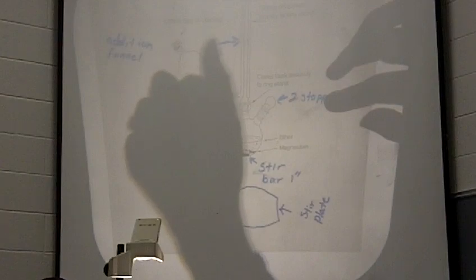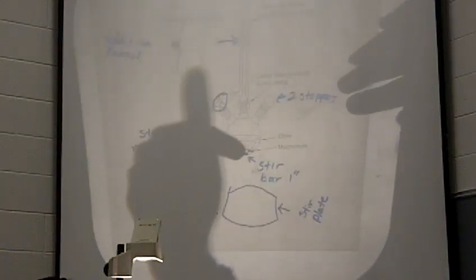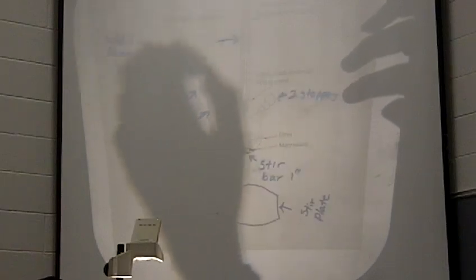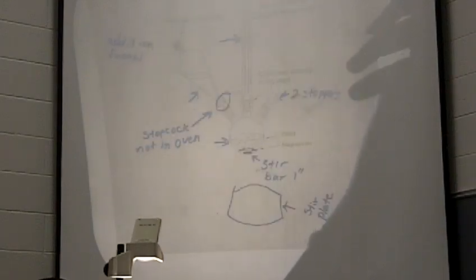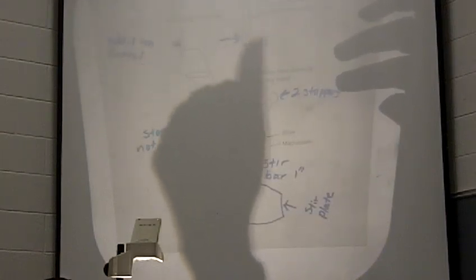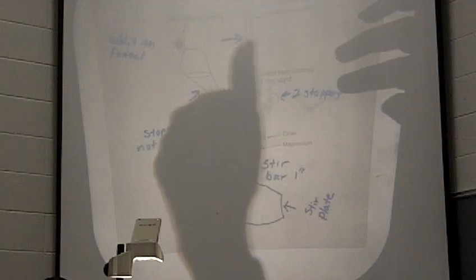The one thing you don't want to do is add all that alkyl bromide to your magnesium all at once. You will get a very, very hot reaction that will get your lab professor moving very, very quickly to get another condenser on top of your reaction, because it will get that hot. And you will quickly kill everything that you've put together here, okay? So you do not want to add the alkyl bromide all at once.